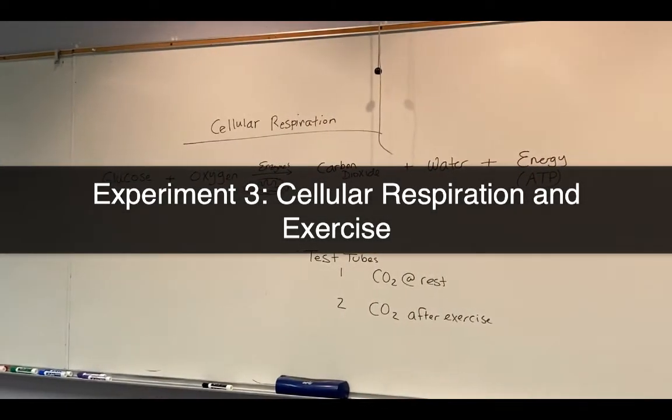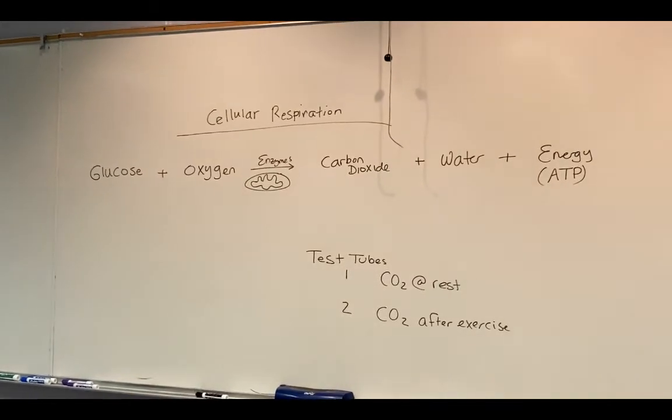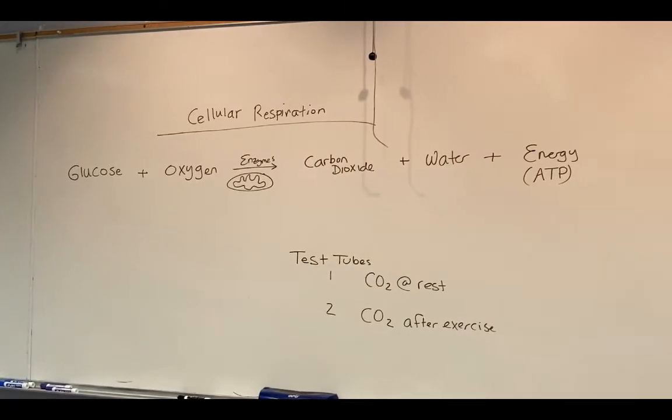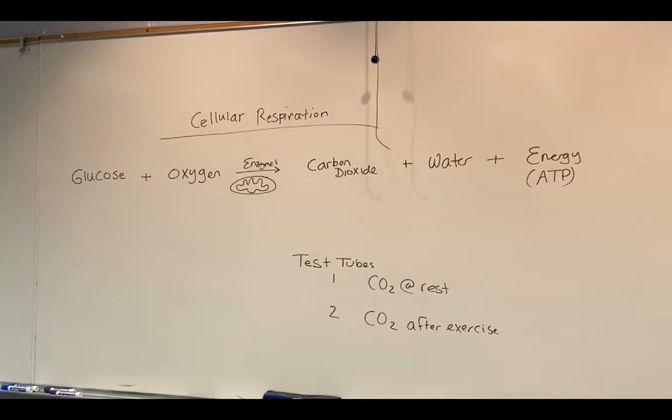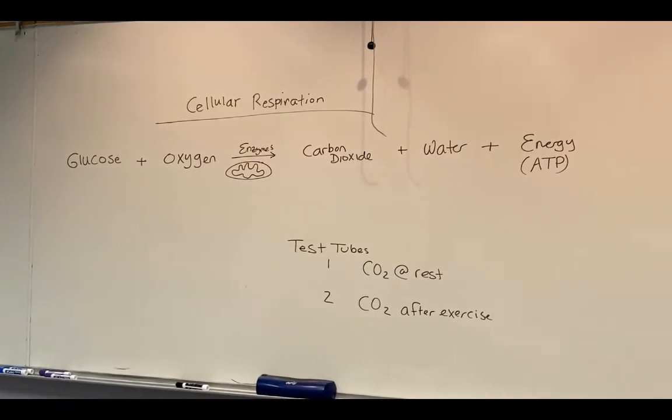Okay, we're ready to begin experiment number 3. You'll see that on page 130 and 131 of your lab manual. And we are going to be explaining the process of cellular respiration. You're probably already familiar with cellular respiration from your lecture class, but we'll go over that very quickly.